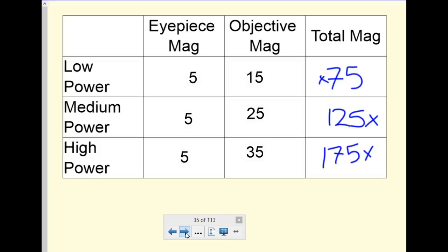Then you are going to look at this underneath low power. Make sure that you turn down the brightness on the microscope because it's too bright. You're going to wash things out and you're not going to see this. This is transparent and it's colorless.